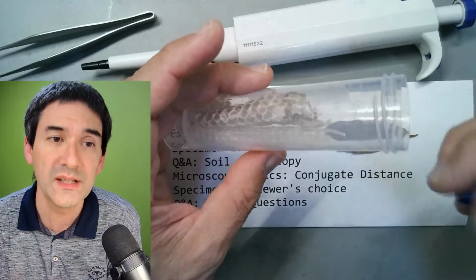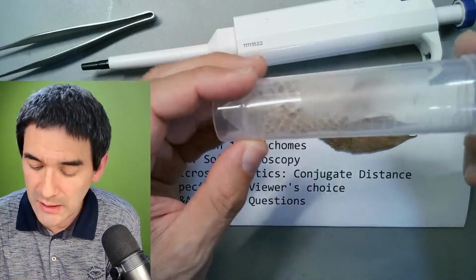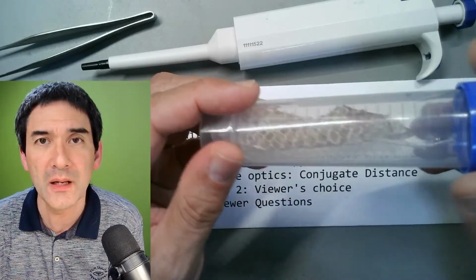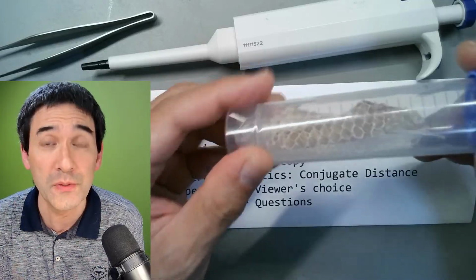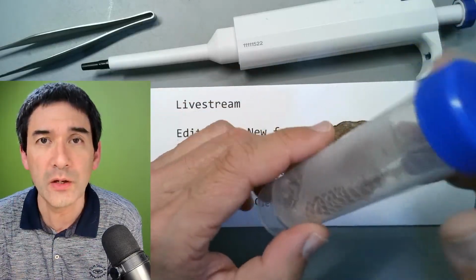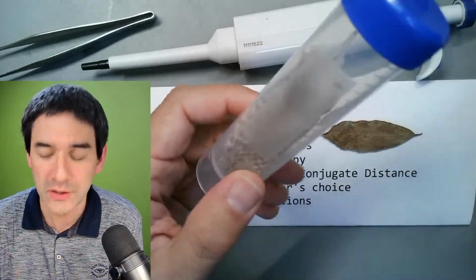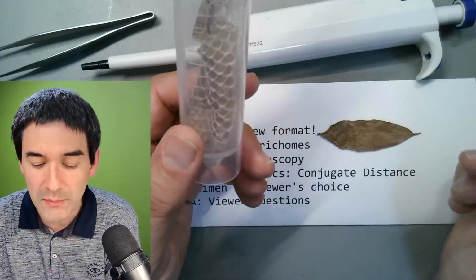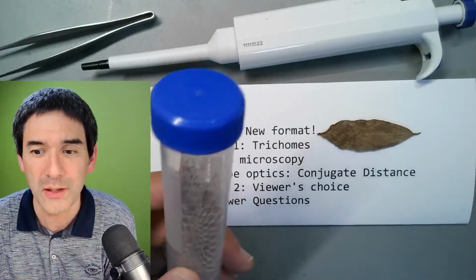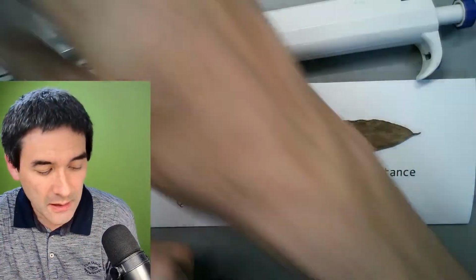So, you know, the snakes, they actually shed their skin. It's a protein, it's called keratin. And these specimens are also quite suitable for stereo microscopy. So I also wanted to do that a little bit. So please, every week also check the polls. I would like to again next week make a poll so that you can choose which specimens you want me to put under the microscope. Okay, so this is a little bit the idea.